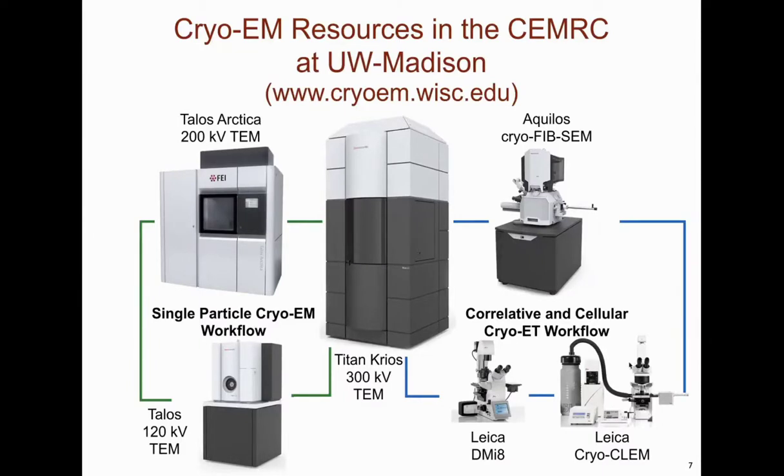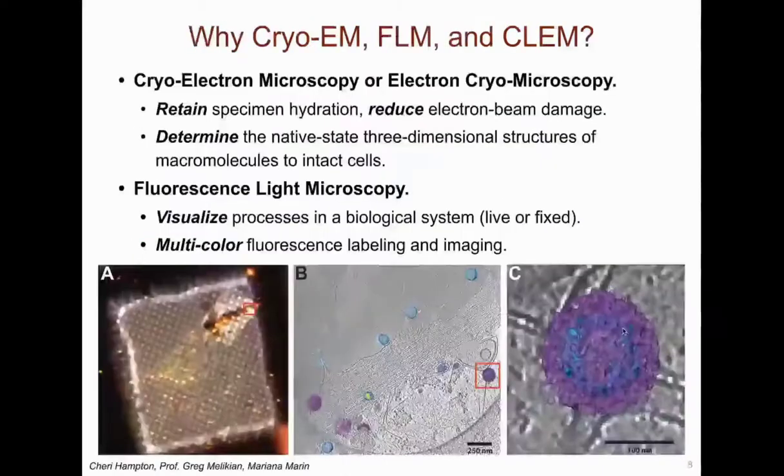We specialize in areas associated with cryo-CLEM and cryo-electron tomography, and have built resources to support studies of biological targets from light level imaging through cryo-FLM, sample milling, and cryo-ET data collection, 3D reconstruction, rendering, and subvolume averaging. The members of the team and instrumentation are essential for the success of cryo-EM studies in the Wright lab and the Cryo-EM Research Center at UW-Madison.